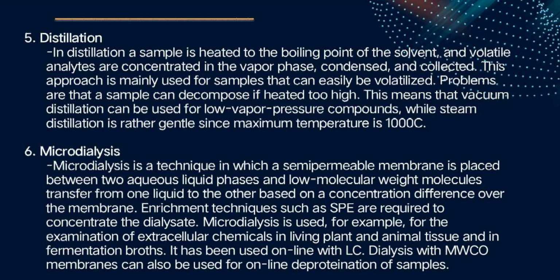Distillation refers to the selective boiling and subsequent condensation of a component in a liquid mixture. It is a separation technique that can be used to either increase the concentration of a particular component in the mixture or to obtain almost pure components from the mixture.